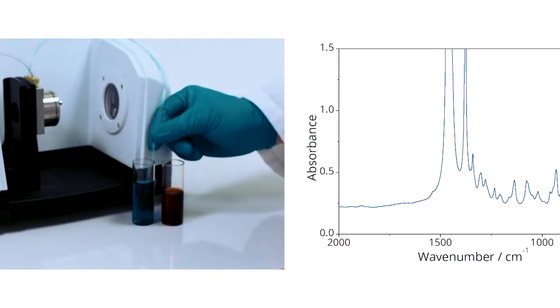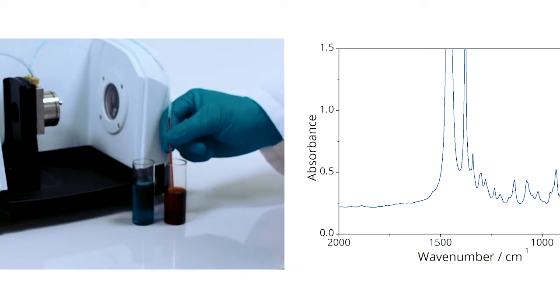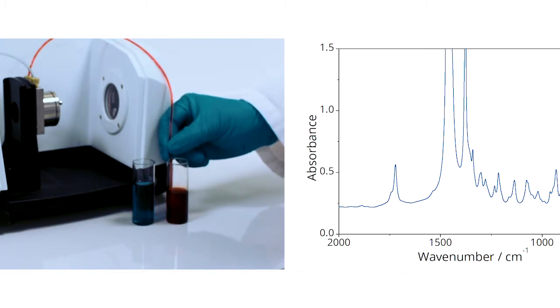In the video on the left, you can see different food dyes flowing through the cell to visually demonstrate a switchover in liquids, whilst the spectra on the right show a solution of heptane switching over to a mixture of heptane spiked with acetone.